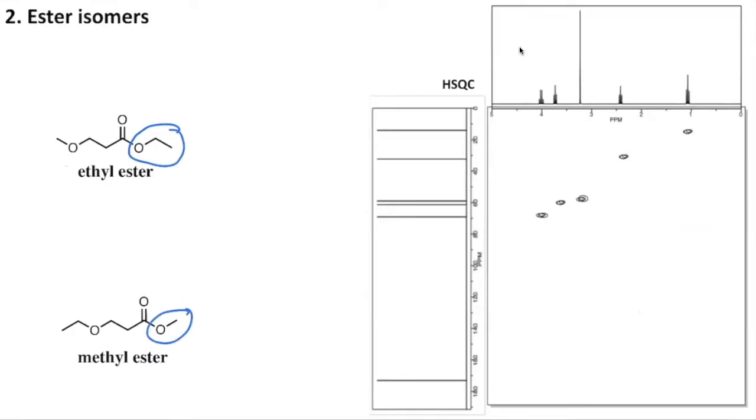So let's first dive right into this proton NMR, because the splitting of the pieces here is really going to help us figure out which hydrogens are which. The HSQC will help us figure out which carbons go with which hydrogens, and then we can fully label everything at the end. So let's start by labeling our peaks in the hydrogen NMR, just as I recommended previously. We'll start at the highest ppm and start with A all the way to E.